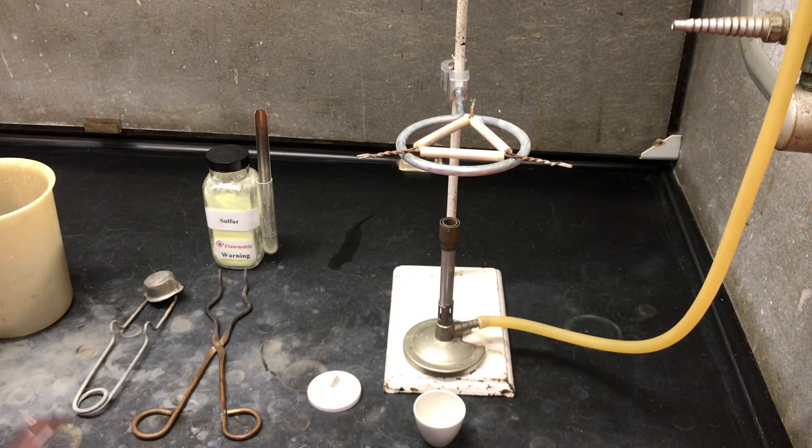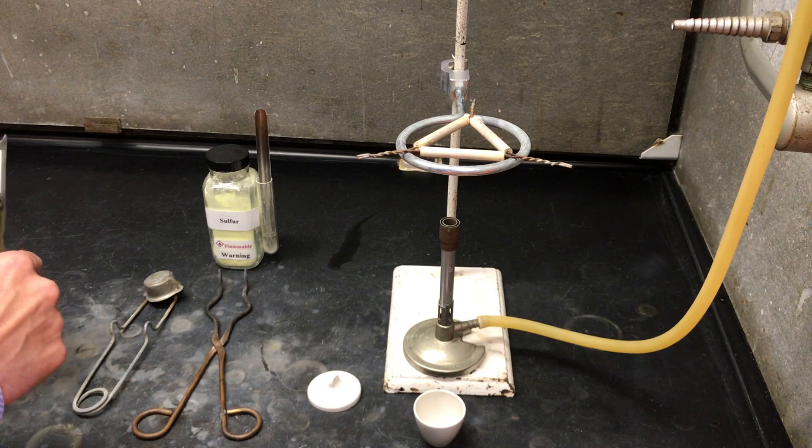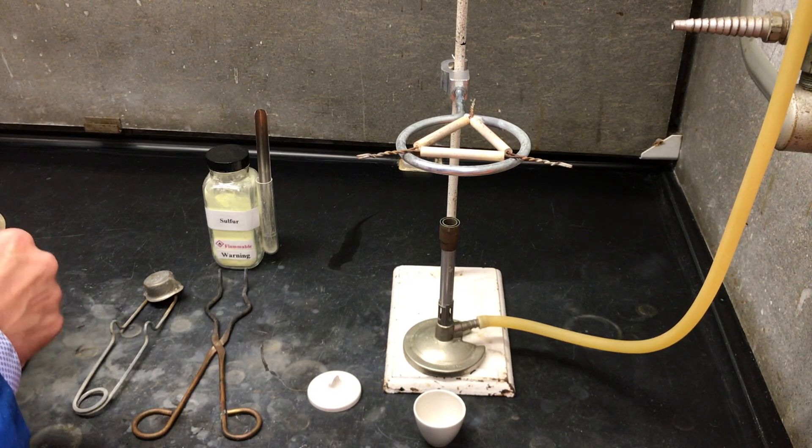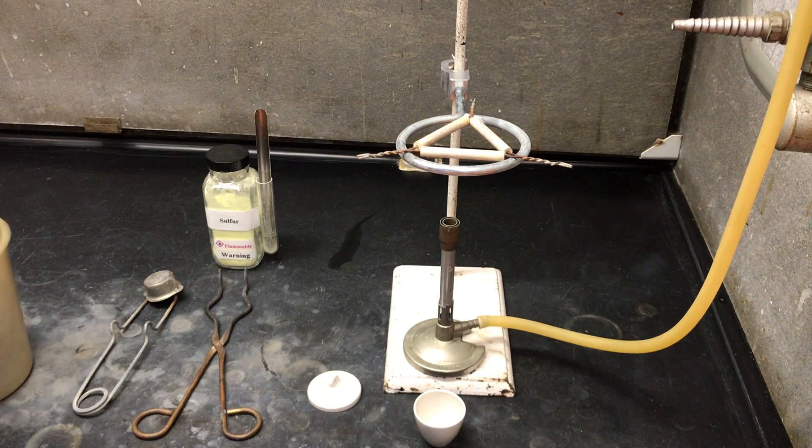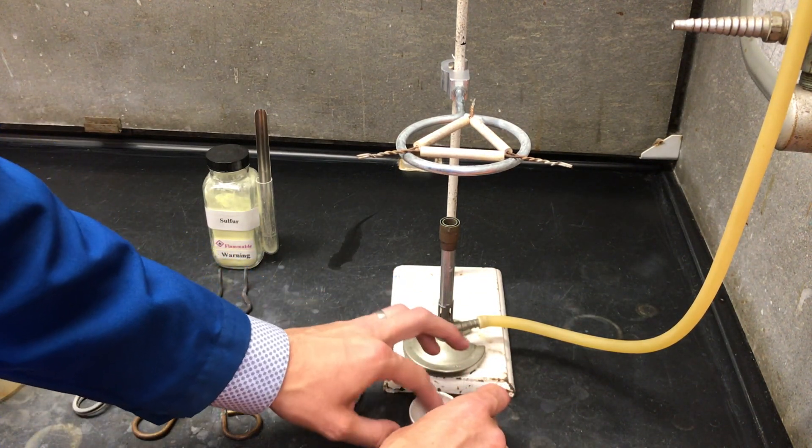This reaction we're going to be using steel wool as iron and heating it in a crucible with elemental solid sulfur. This reaction will be done in the hood as the compounds produced are strong irritants.